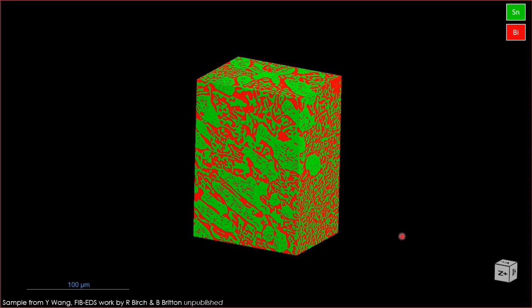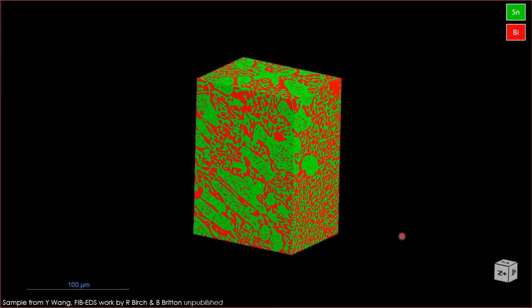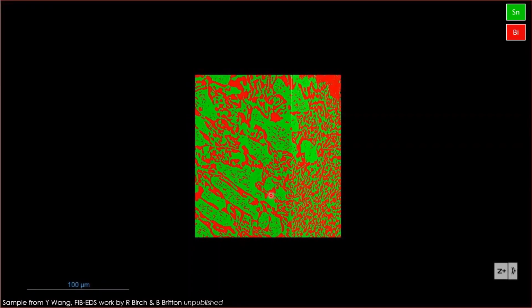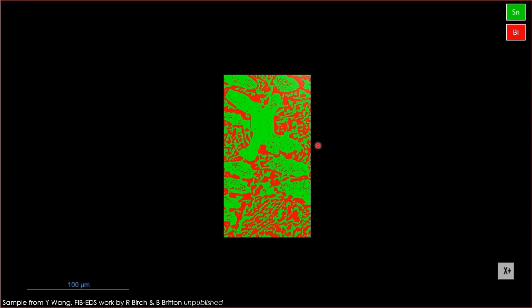But it's beautiful. We've actually seen this micrograph elsewhere. And so here we can now start to see this microstructure, and we can see the value of the three-dimensional data set because you can see this herringbone-like morphology. And we can start to look at, for instance, the dendrite arm spacing, primary, secondary, and tertiary. We can also look at the decomposition of the eutectic, and we could look at the area fractions, and we could look at statistical regions.